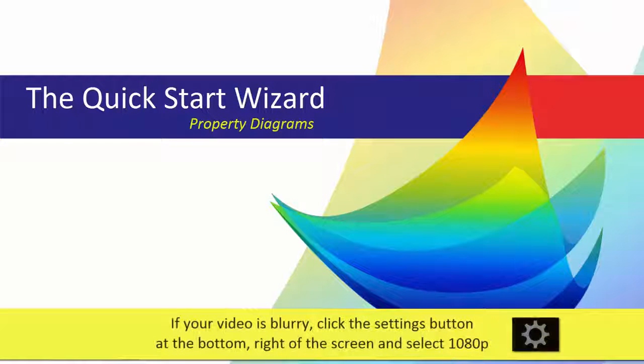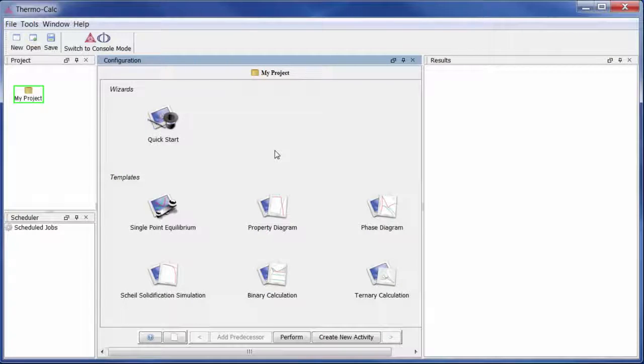The Quick Start Wizard is an easy way to learn how to use TherMo-CALC in the graphical mode before you know how to work with TherMo-CALC projects. Let's begin in the default window layout with an empty project. If you're in console mode, simply click this button to switch to the graphical mode.